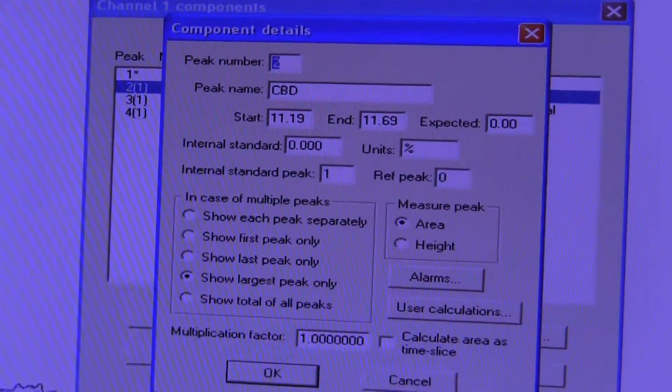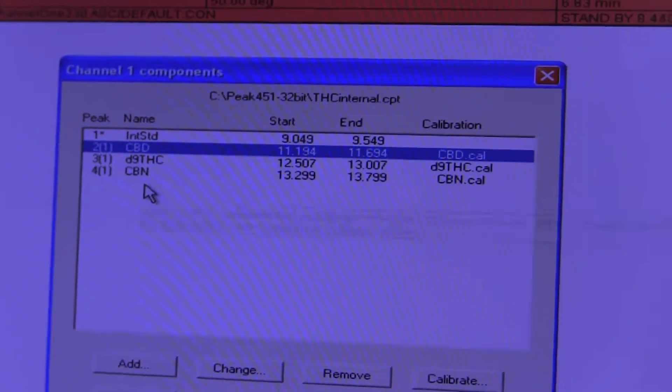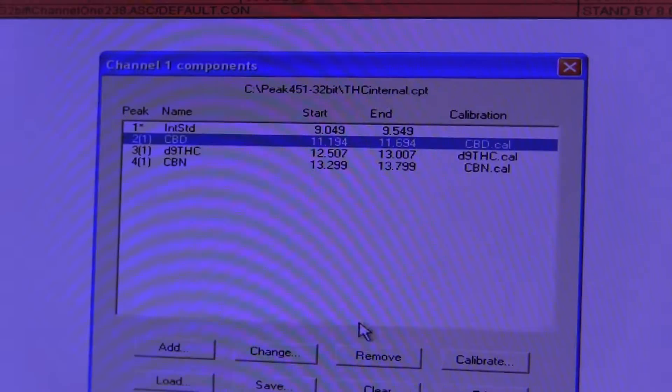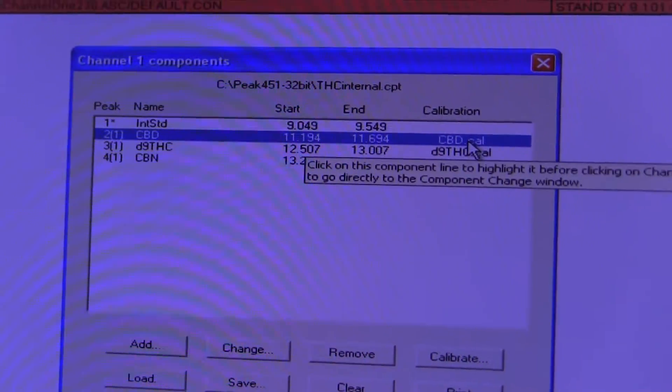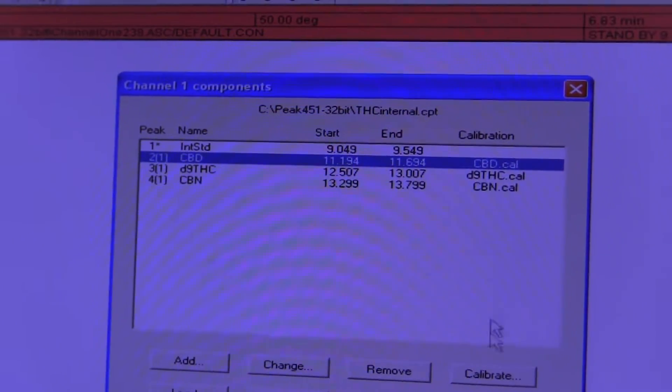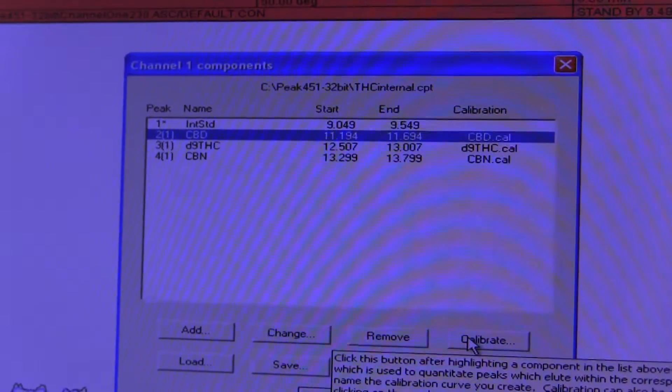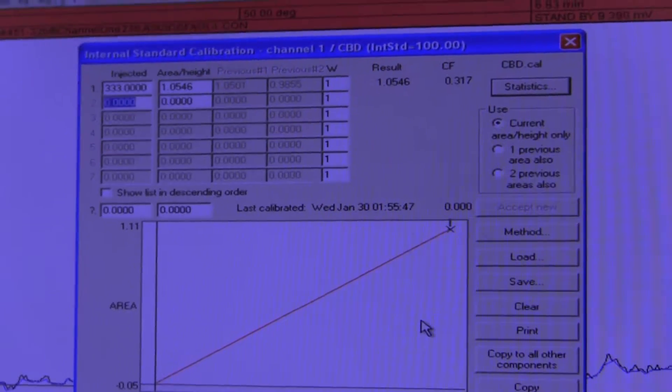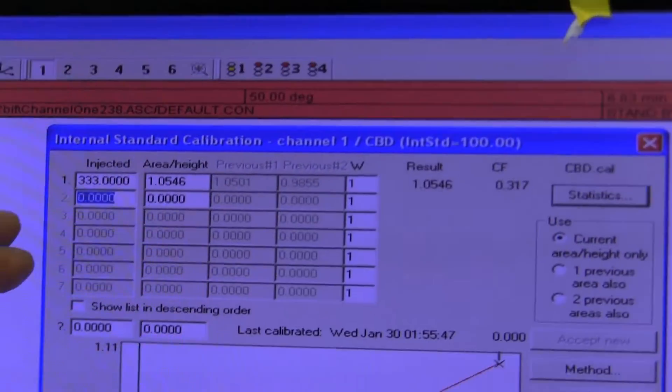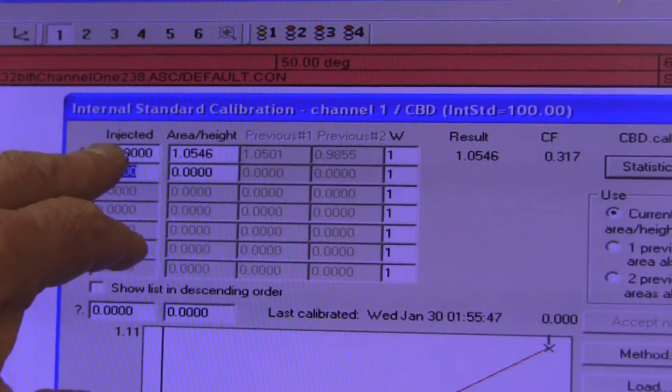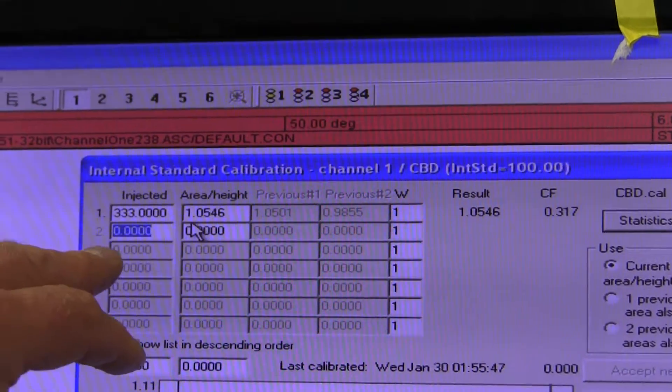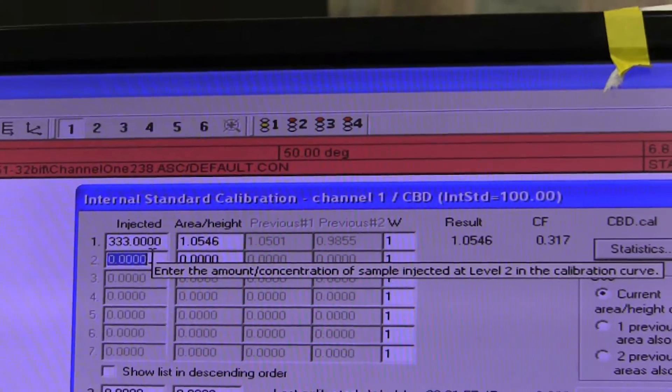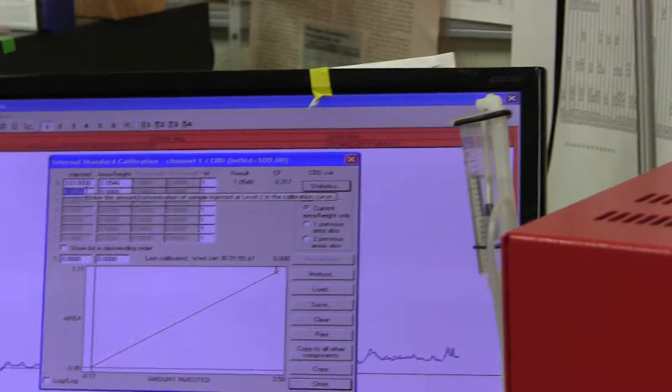Here in the software now, we have our list of components. For instance, for CBD, the name of the calibration curve for CBD is CBD.cal. When we look at that calibration curve, you can see that the amount we're putting in this first column is 333, which is the 333 nanograms per microliter that we all agreed was what was in this bottle.